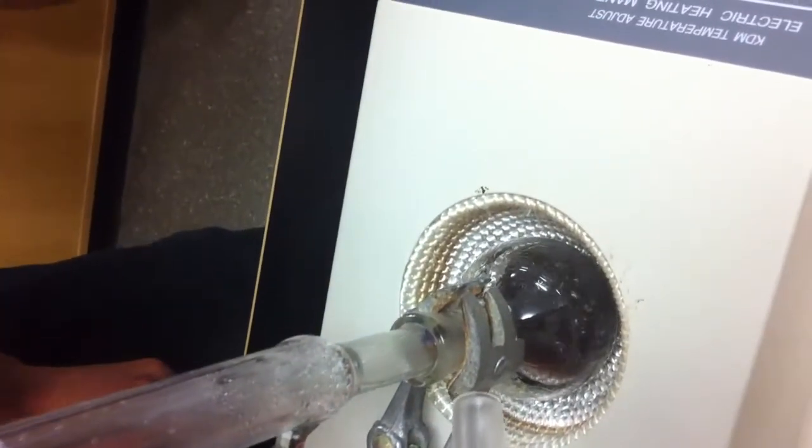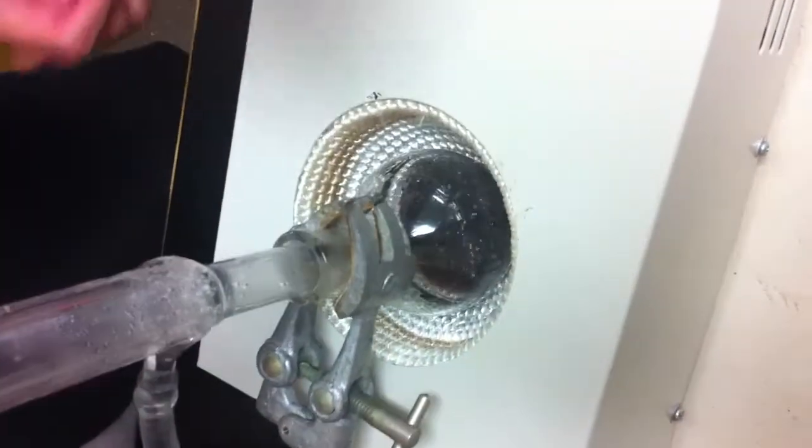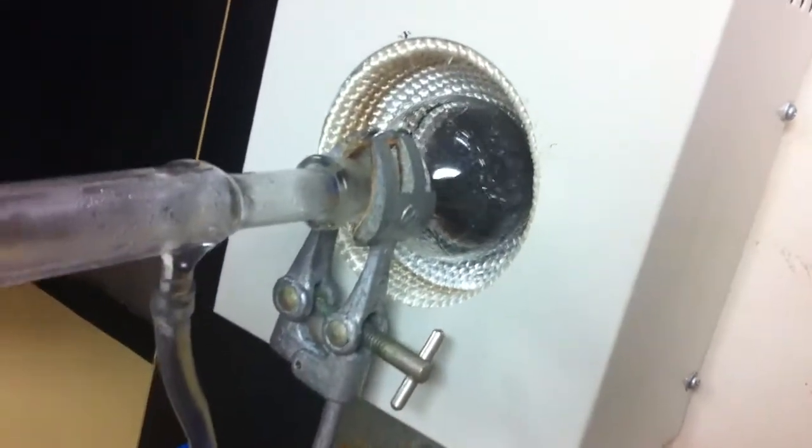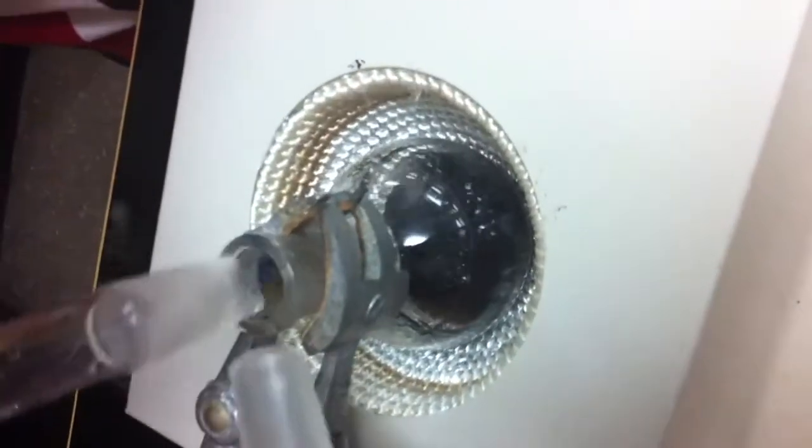But the ester will keep on cooking through the equilibrium. It's stuck. Hey, can you plug in the top first? Stop, wait, plug in the top. Why would that do anything? It's not working. Wait, turn back on the condenser. Because what's happening is it's all escaping. Oh, now we're failing. Hurry up, go. It's all evaporating away. We need the condenser to stop it from evaporating. Switch it off. Yeah, hurry up, take it out. Take the top off. Okay, good. Okay, turn off the condenser. Now plug it in.